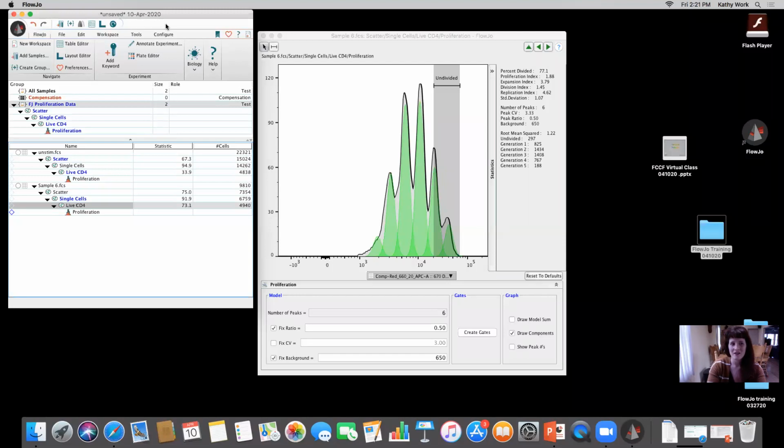So you can't ask for a miracle if the data doesn't look that good. But yeah, Kathy, you're absolutely correct. You need to try and see which constraints, which parameters of the model give you a better fit, and look for that. That's your criteria, right? How good my fit can be, and then just go with the best fit.